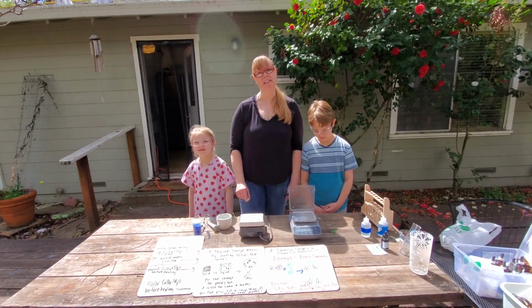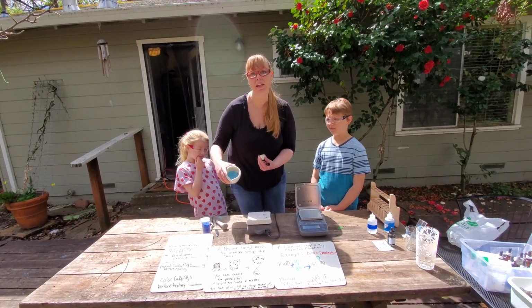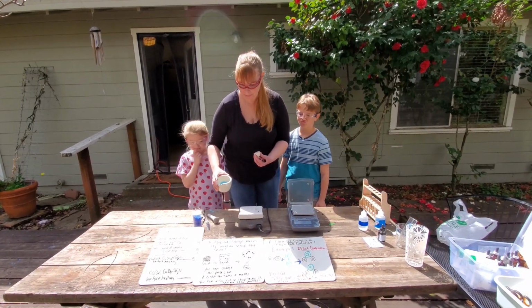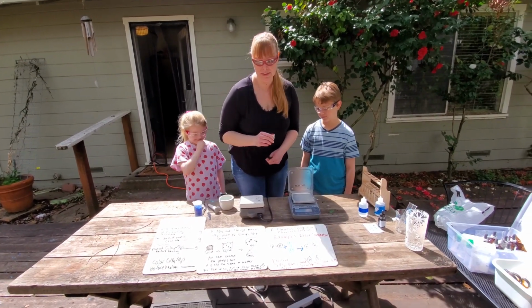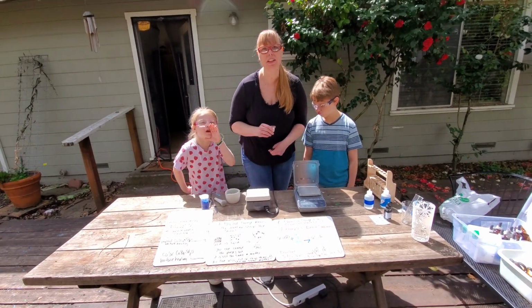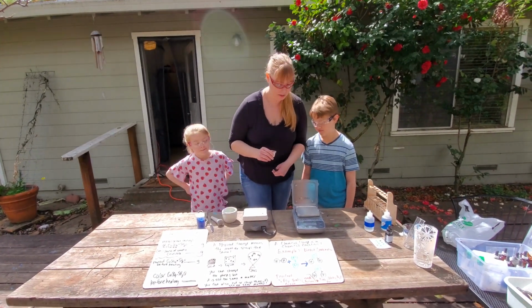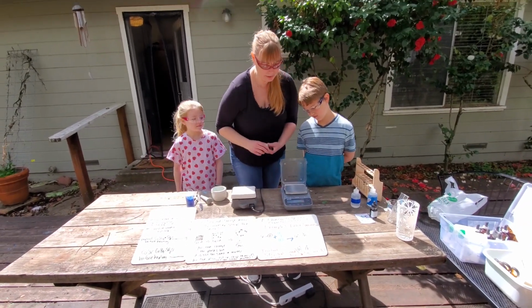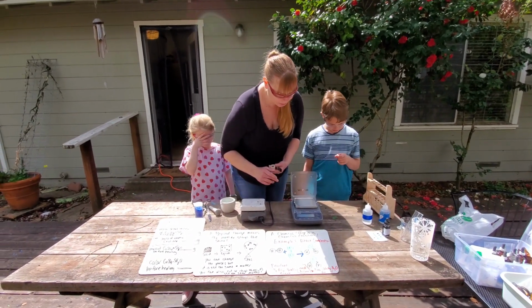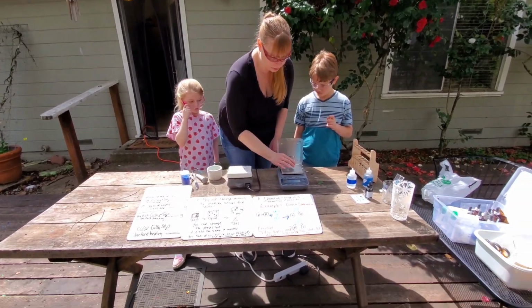Okay. Students, we're on investigation number 6 now, and we're still using that same copper sulfate pentahydrate blue powder that we just ground up. But this time we're going to heat it. So we're going to say what happens after heating. This time we're going to get actual quantitative data, which means numbers. Okay, so we're first going to figure out what the mass of the crucible is when it's empty. There's nothing in here right now.